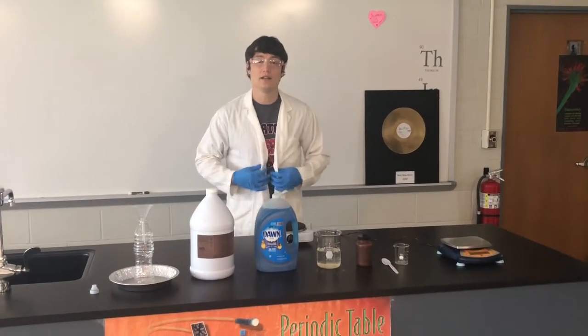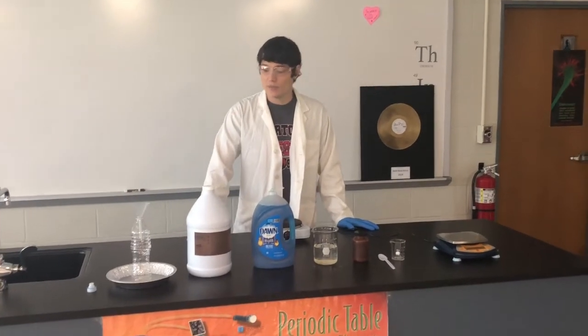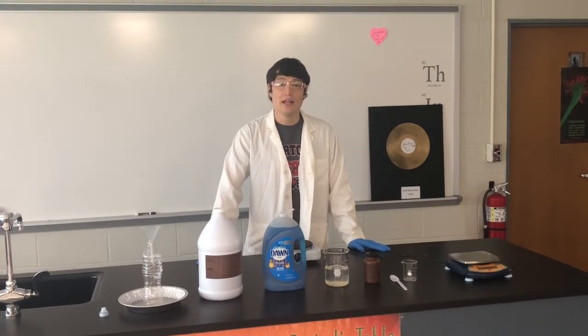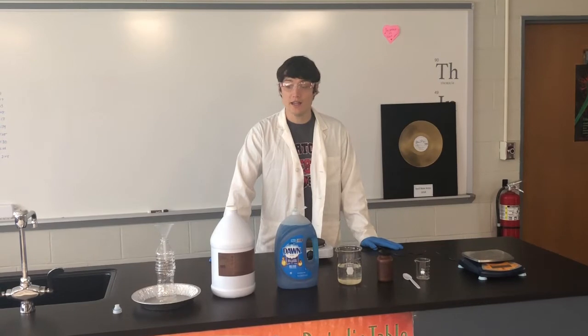I've got my glasses on, lab coat, and gloves, because it is pretty dangerous. So let's take a look at what we're going to do today. We're going to pull apart our H2O2 into plain old oxygen O2 and water. That's the game plan for today.